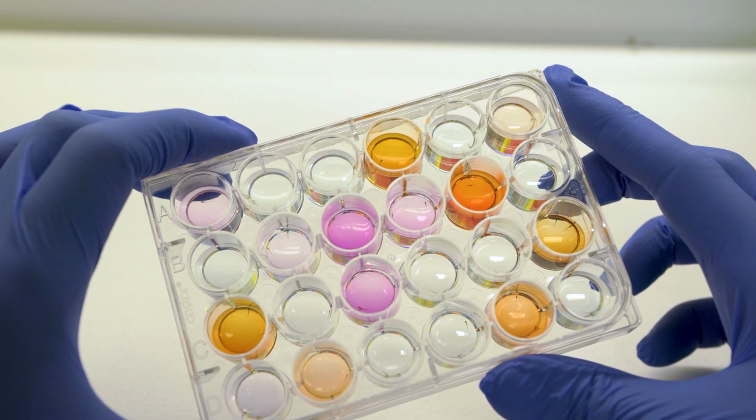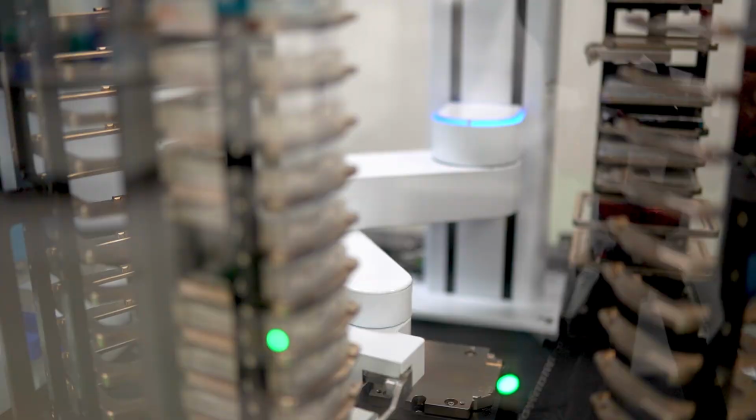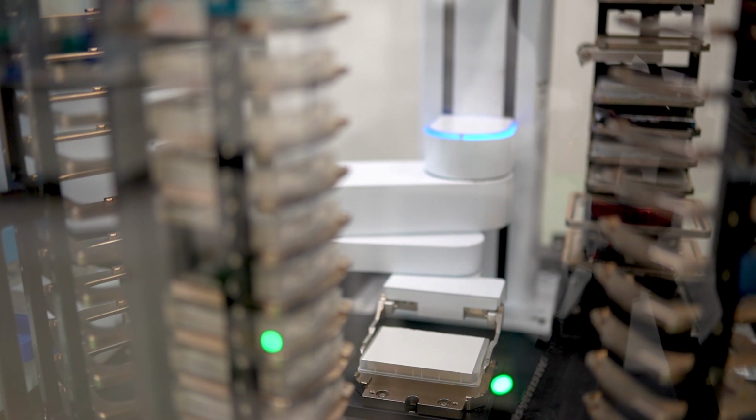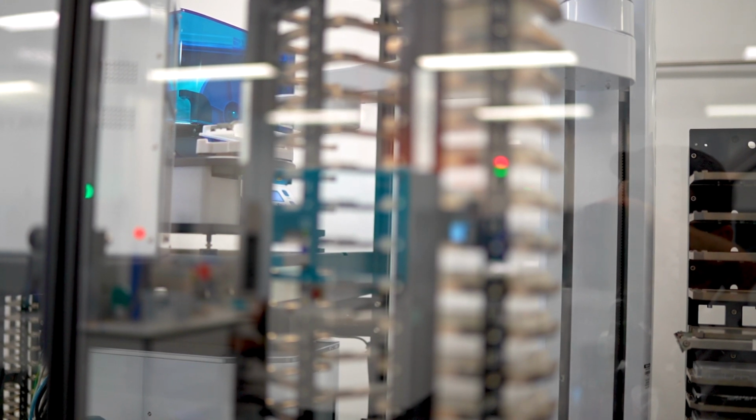But most importantly, we use this animal in my lab because it's small enough to fit in what we call screening plates, and combined with our engineering skills and the automatic system we have here at GRIDD, we can screen hundreds of compounds every week to try to find molecules with bioactivity against those diseases and try to translate that into new medicine for patients. So this is extremely powerful.